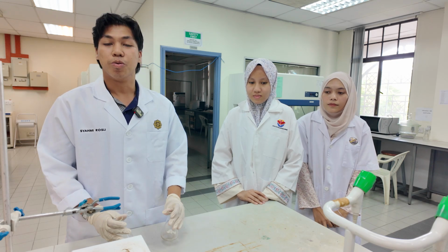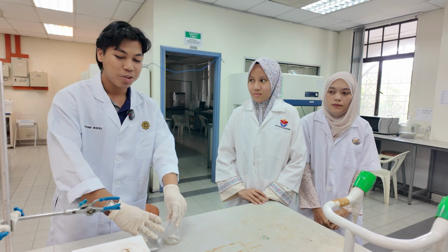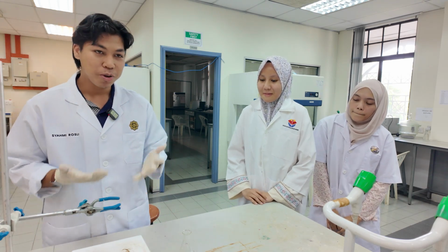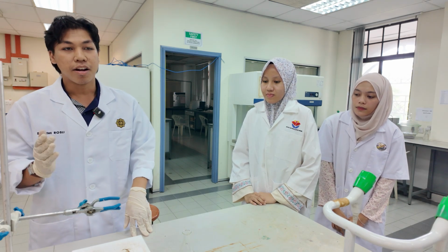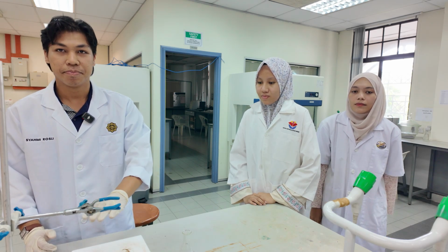Is that it? No. We have health, safety, and precautions. The first thing, always wear your gloves and your lab coat, and avoid touching the hot plate because it will burn your hand.